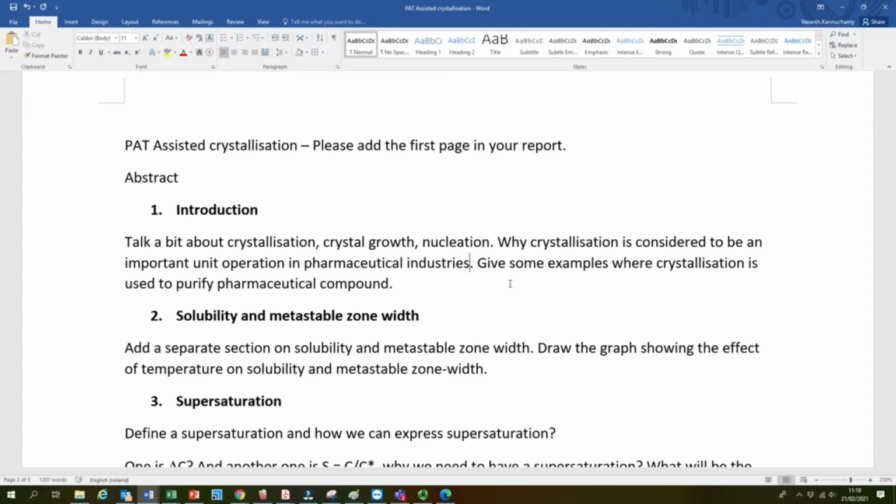And crystallization also works when you start from a crude material, say 100 grams. Out of that 100 grams, say 30% is your impurity, which means 30 grams. Even when you have an extremely high level of impurities, crystallization will still work. Crystallization can still produce a relatively pure product. So that's the main advantage of crystallization. It's relatively flexible irrespective of the impurity concentration in your starting material. So this is one of the main advantages of crystallization.